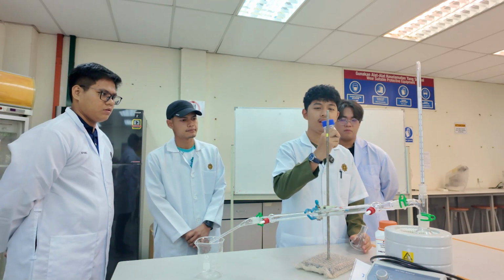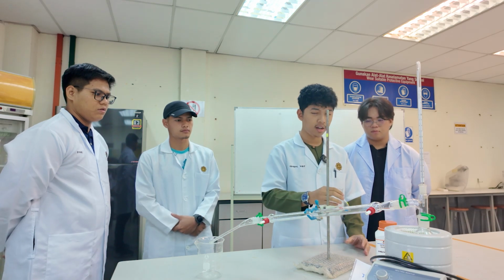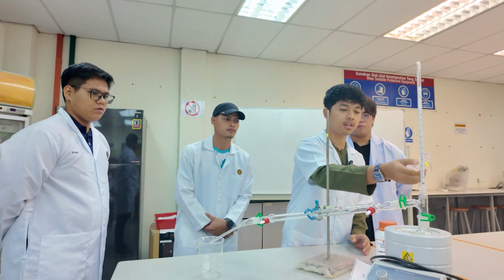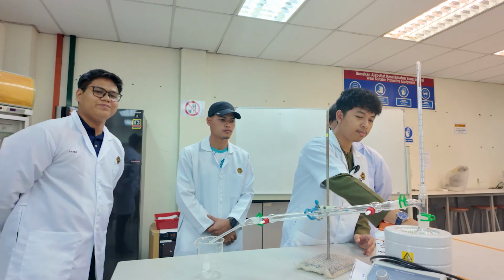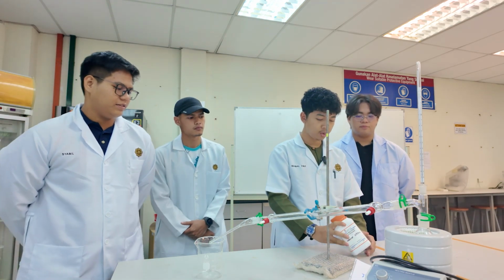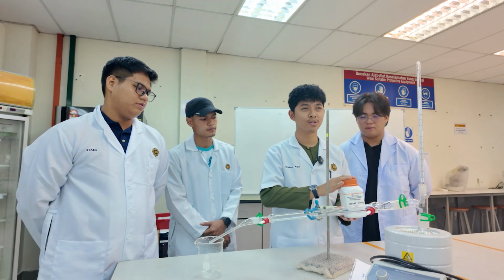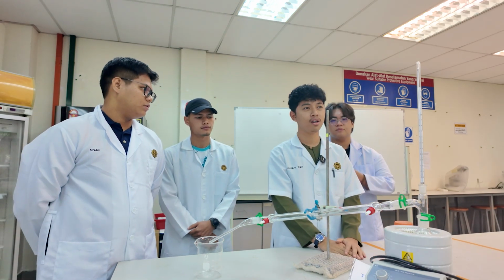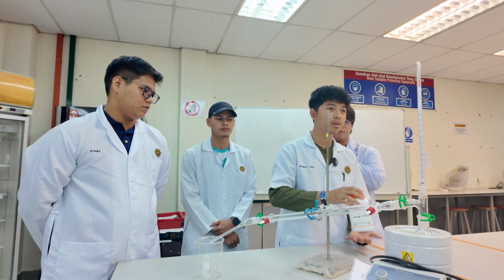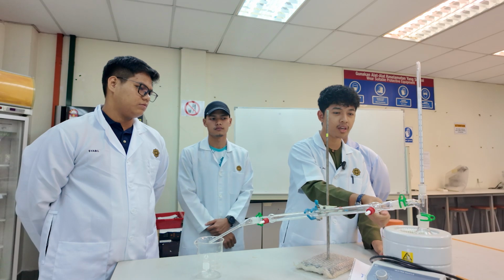And after we add this anhydrous sodium sulfate, we let it dry, and then we pour it into the round bottom flask. Before we heat it, we need to add our granules to prevent bumping and violent boiling, and it will allow the solution to boil smoothly. Okay, after that, we heat it.